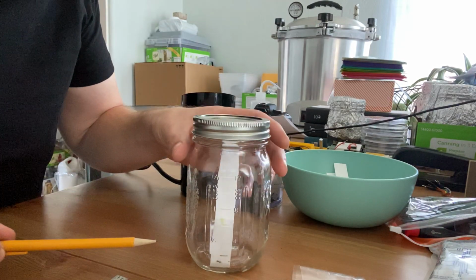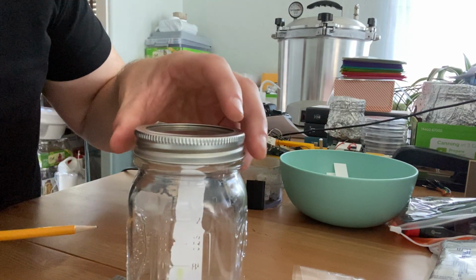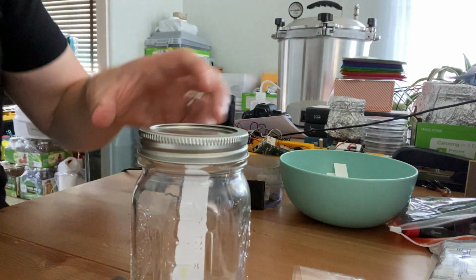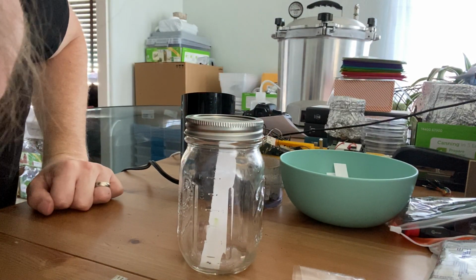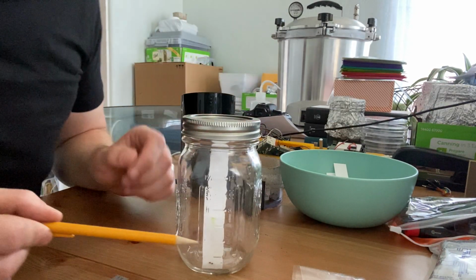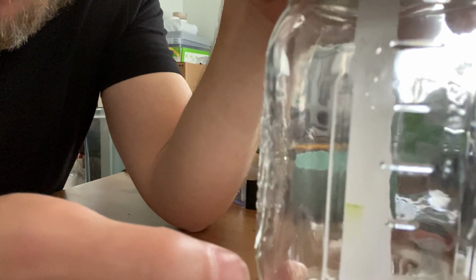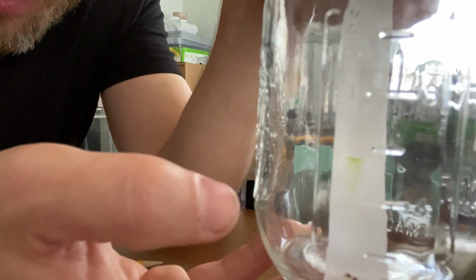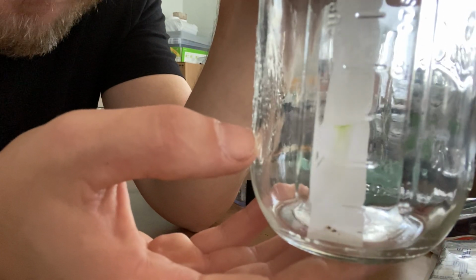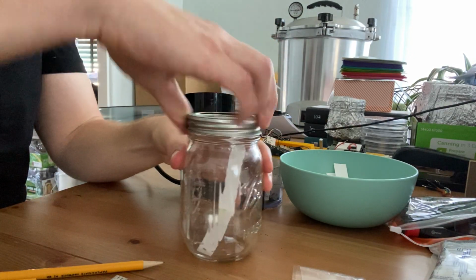And so here we go, and I can already start to see some results, but it looks like it's still traveling here. So we give it a little more time, and it looks like it's almost done moving up. Quite interesting indeed what I'm noticing, and it's kind of hard to tell in the video. Let's see if I can get it a little bit closer. You can actually see the solvent front where there's that really pronounced green line there. Yep. And just make sure it's not moving up anymore. And it doesn't look like it. So I'm going to take this out.